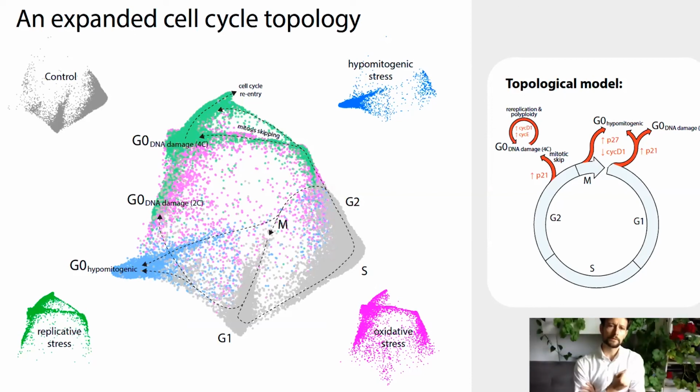Do you know what fraction of the total variance in your data is captured in the lower dimensional projection? That's always a trade-off. The lower dimensional projection helps us understand and visualize the data, but do you feel that it really captures all of the essential, biologically meaningful dimensions in your data? Or do you think that perhaps there might be additional features that are just hard to project with any method?